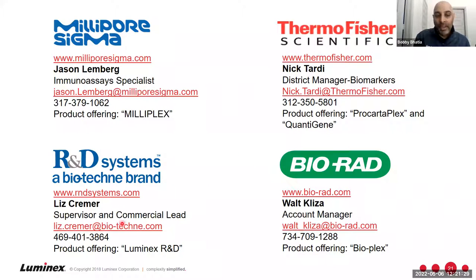These are four representatives. I left their information right here. Arthur, do you want to just mention anything briefly about these four companies, or as you mentioned before, the researcher is responsible for purchasing their own kit. As you mentioned, they have to reach out to them, and they can talk about how they want to design their assay, how they want to customize and build it.